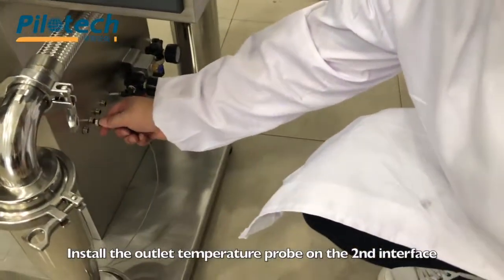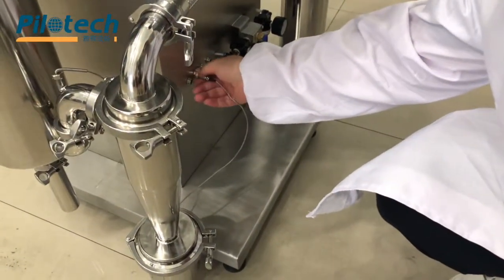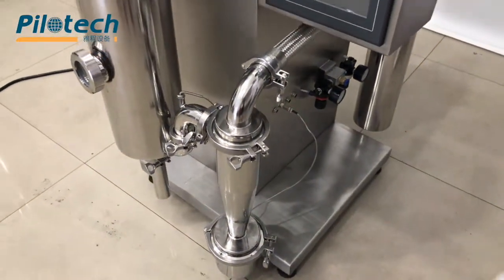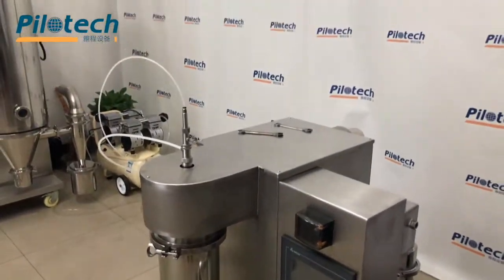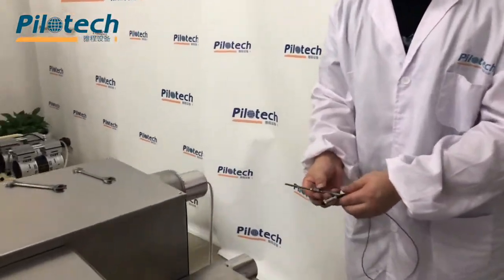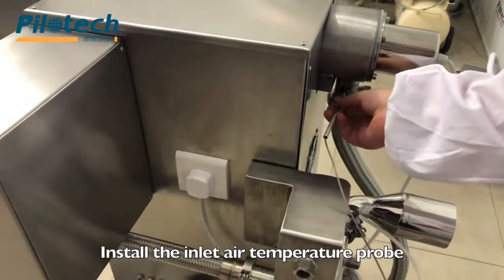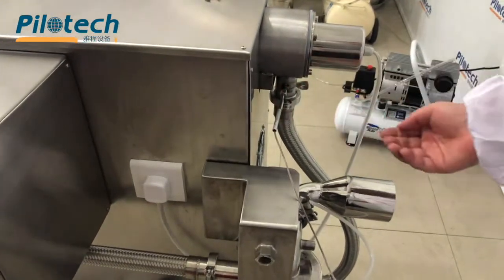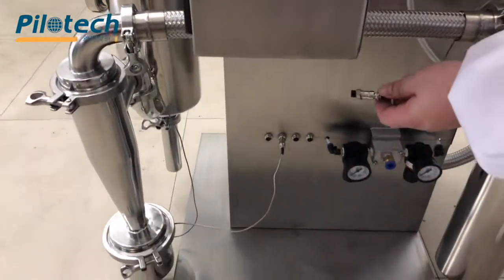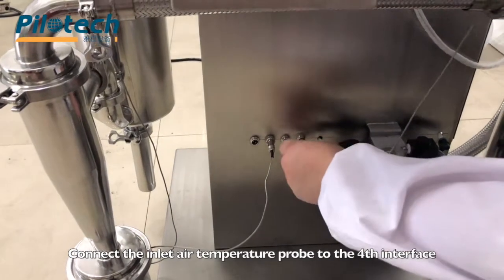Install the outlet temperature probe on the second interface. Install the inlet air temperature probe. Connect the inlet air temperature probe to the fourth interface.